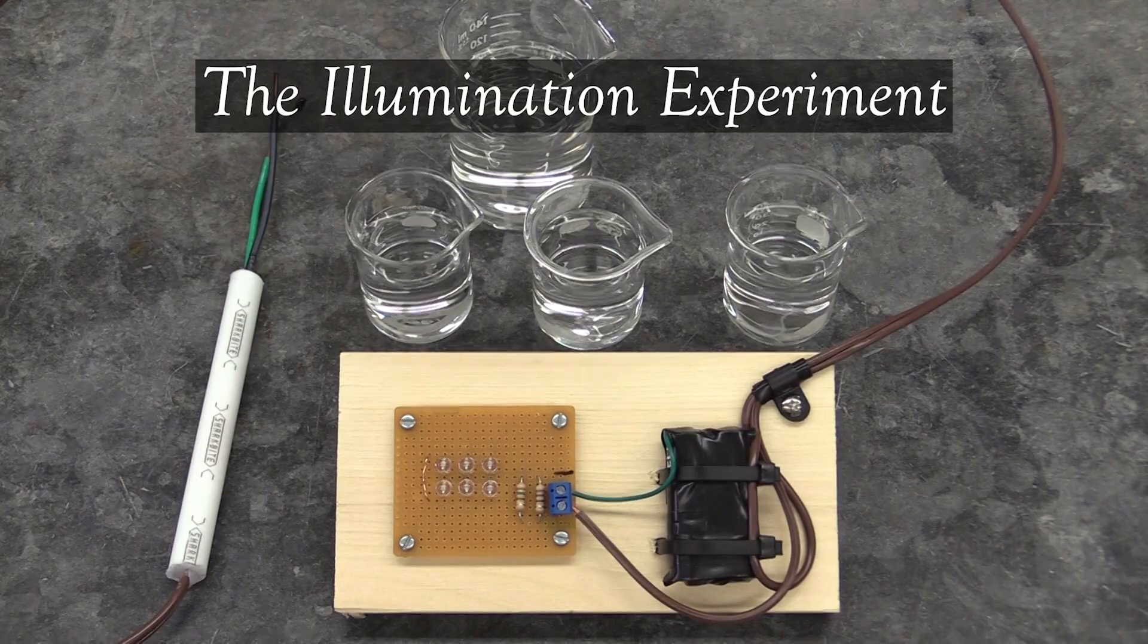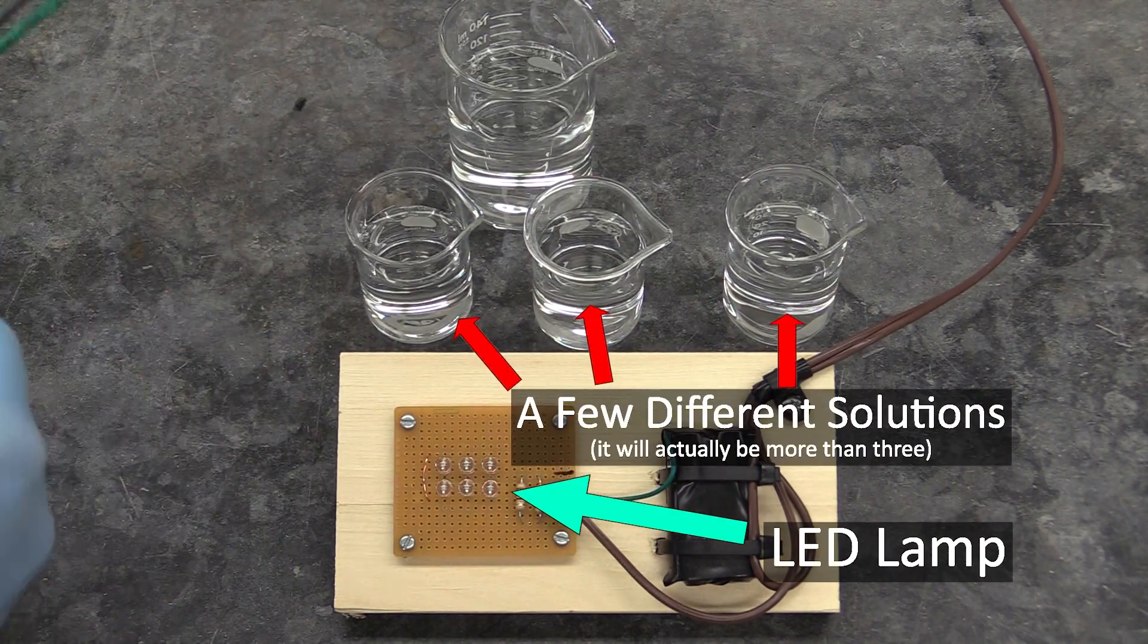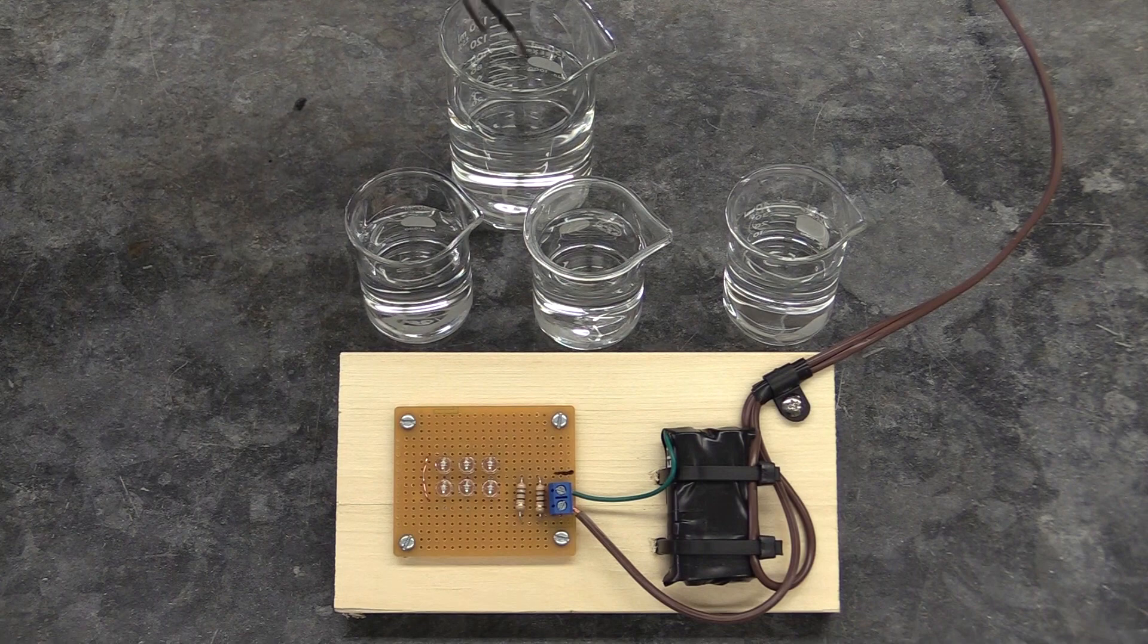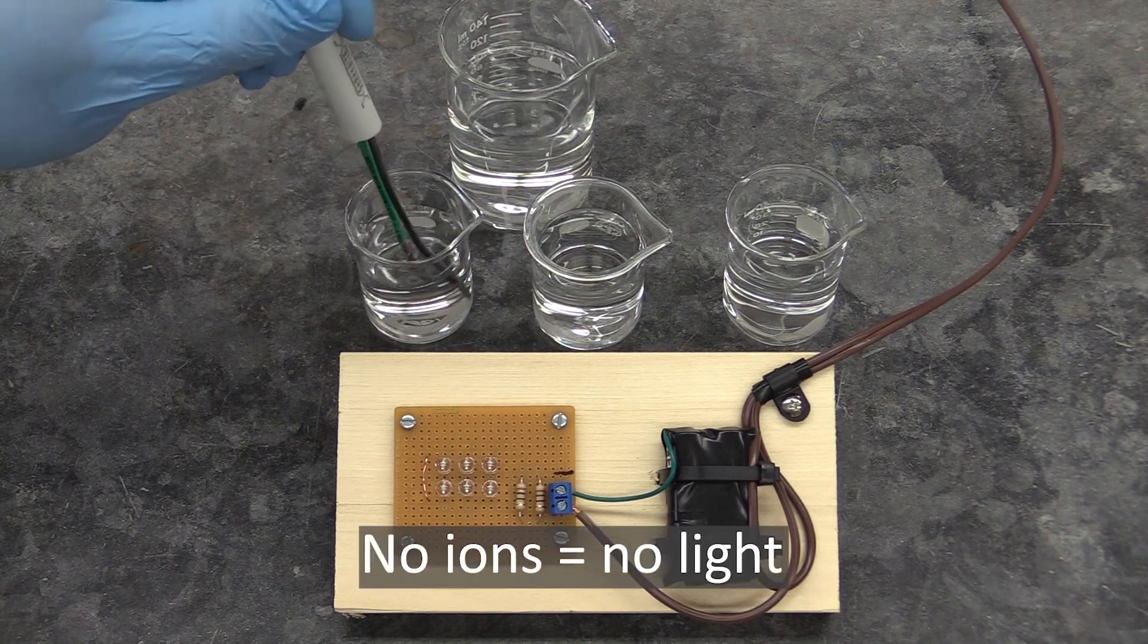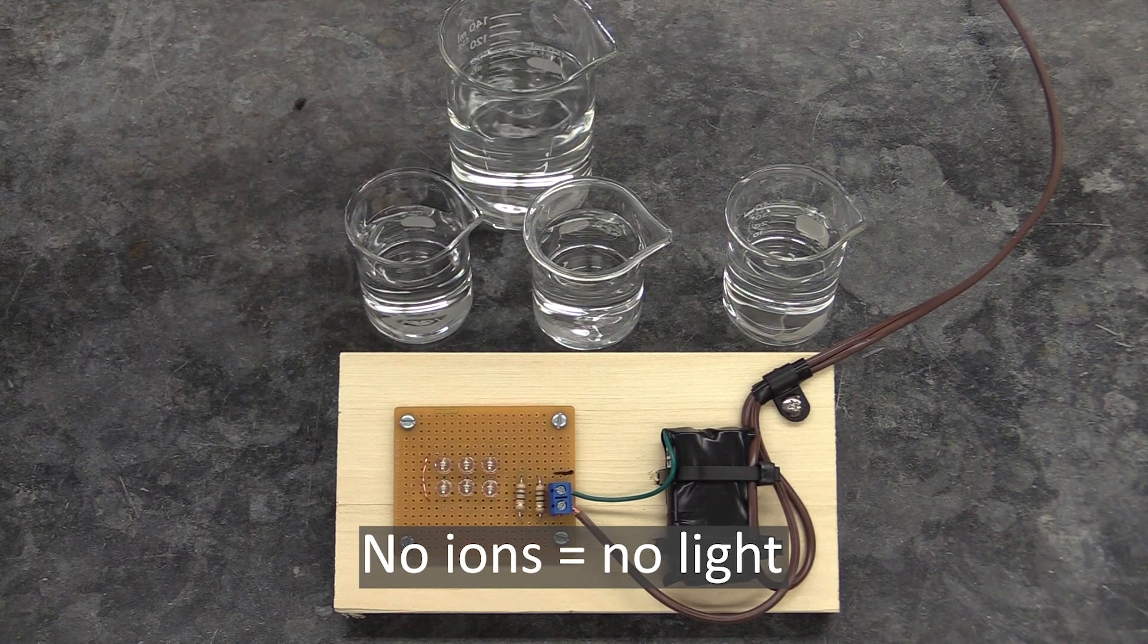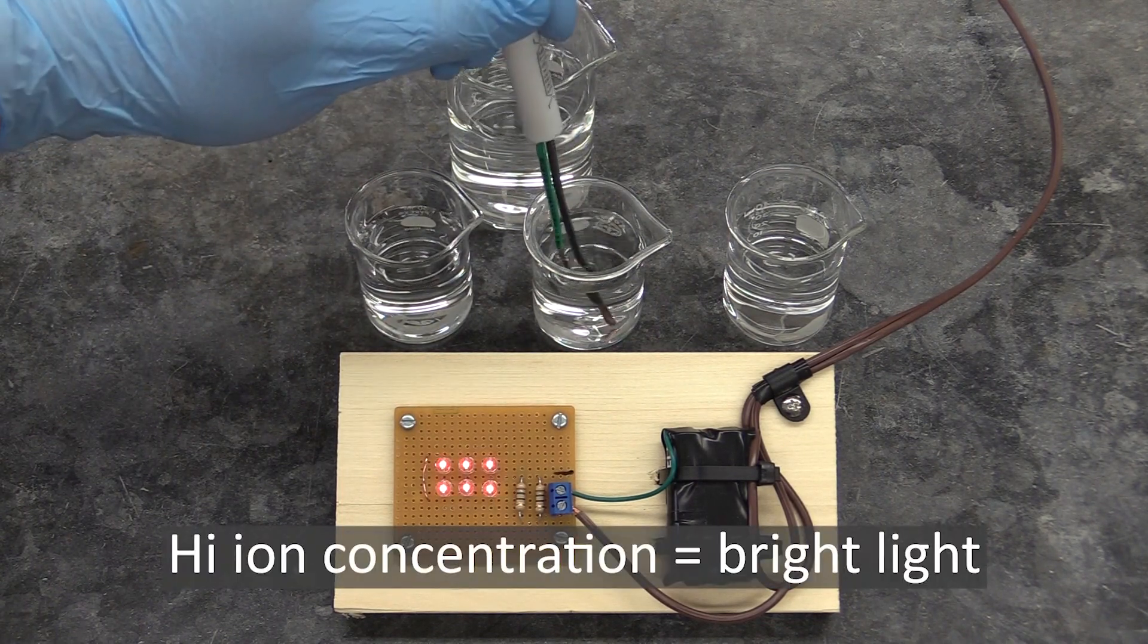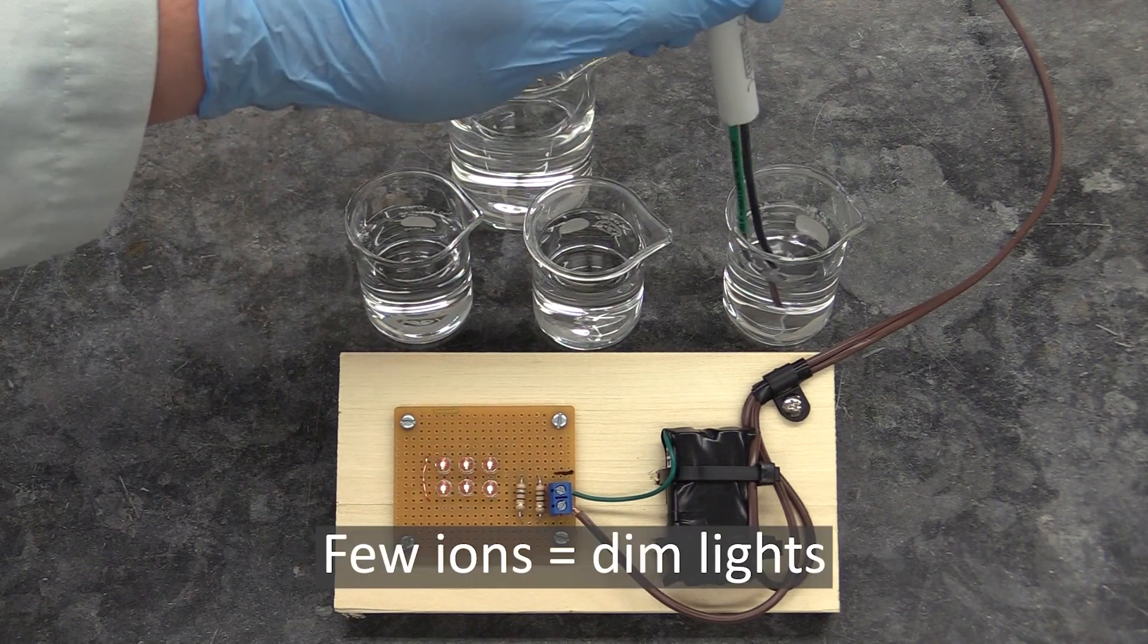In the illumination experiment, you will use an LED lamp to test a few different solutions for their ionic strength. If the solution you're testing has no ions dissolved in it, it won't be able to conduct electricity and the LEDs won't light. If the solution has a lot of ions, it will conduct electricity and the lamp will light up brightly. And if it has a few ions, the LEDs will light, but they'll be dim.